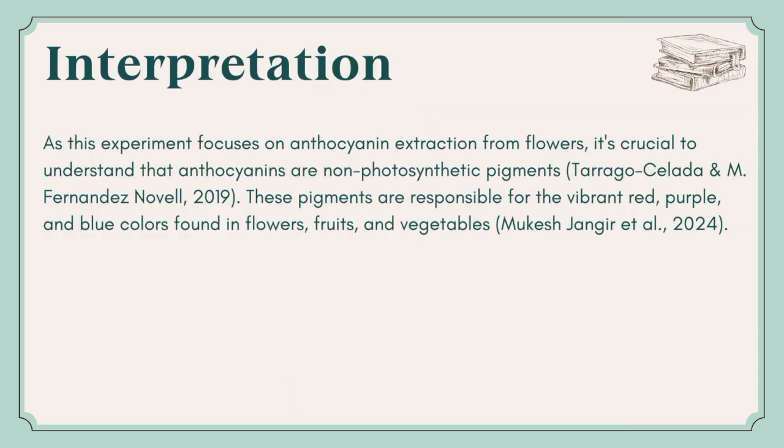Okay, so this experiment focuses on anthocyanin extraction from flowers. It's crucial to understand that anthocyanins are non-photosynthetic pigments, so they are not the same as chlorophyll. These pigments are responsible for the vibrant red, purple and blue colors found in flowers, fruits and vegetables.